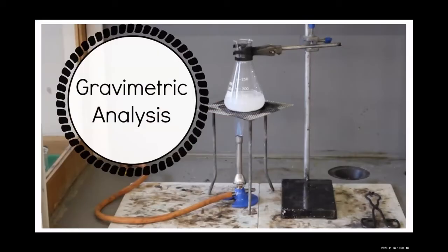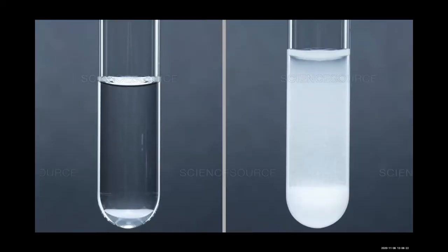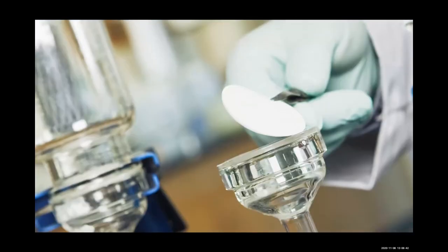When chemists are faced with problems that require them to determine the quantity of a substance by mass, they often use a technique called gravimetric analysis. In this technique, a small sample of the material undergoes a reaction with an excess of another reactant. The chosen reaction is one that almost always provides a near 100% yield. If the mass of the product is carefully measured, you can use stoichiometry calculations to determine how much of a reactant of unknown amount was involved in the reaction. Then, by comparing the size of the analysis sample with the size of the original material, you can determine exactly how much of the substance is present.